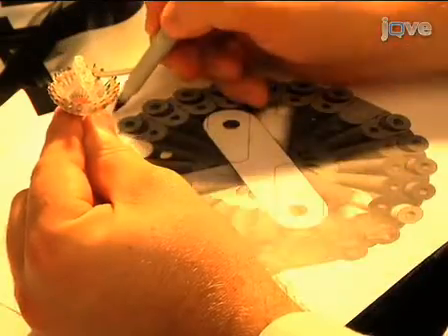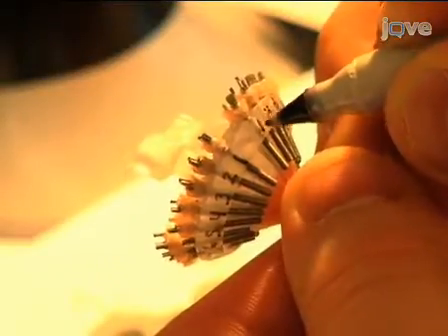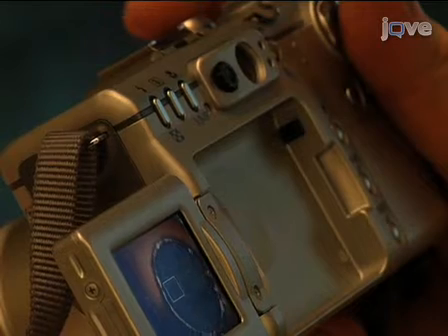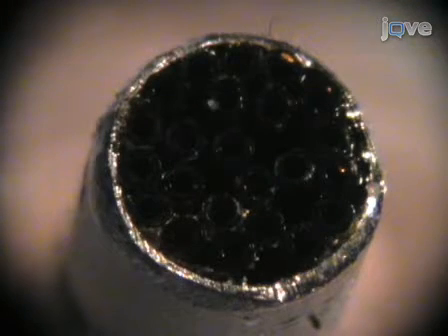Create a top-down view schematic of the microdrives and give each microdrive a unique name or number. Now, looking in the stereoscope, flip the drive upside down and take a picture of the bottom of the collector cannula and guide tubes. Make a printout of the picture that can be used as a reference in the following steps.